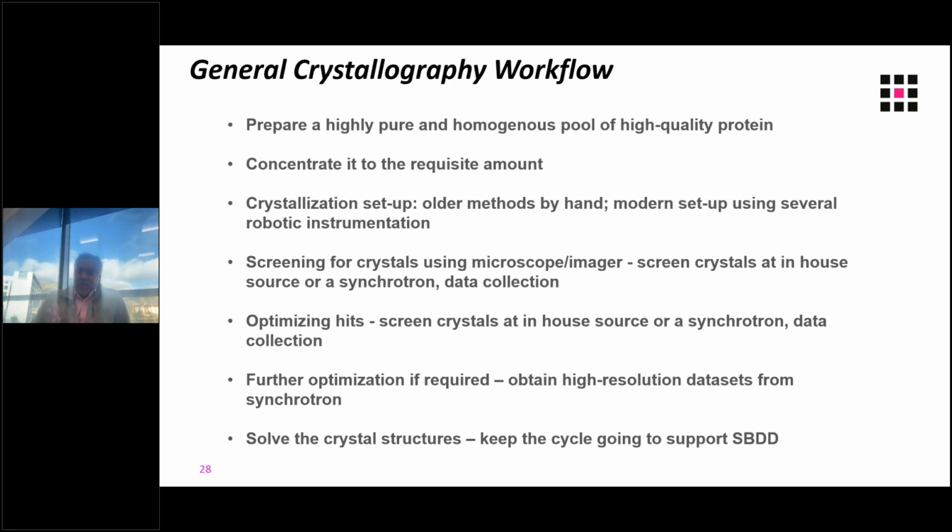Of course, following successful crystallization experiments, we would screen for crystals using microscopes or imagers, and then fish the crystals and try to shoot them either at an in-house source or at a synchrotron, and collect data.